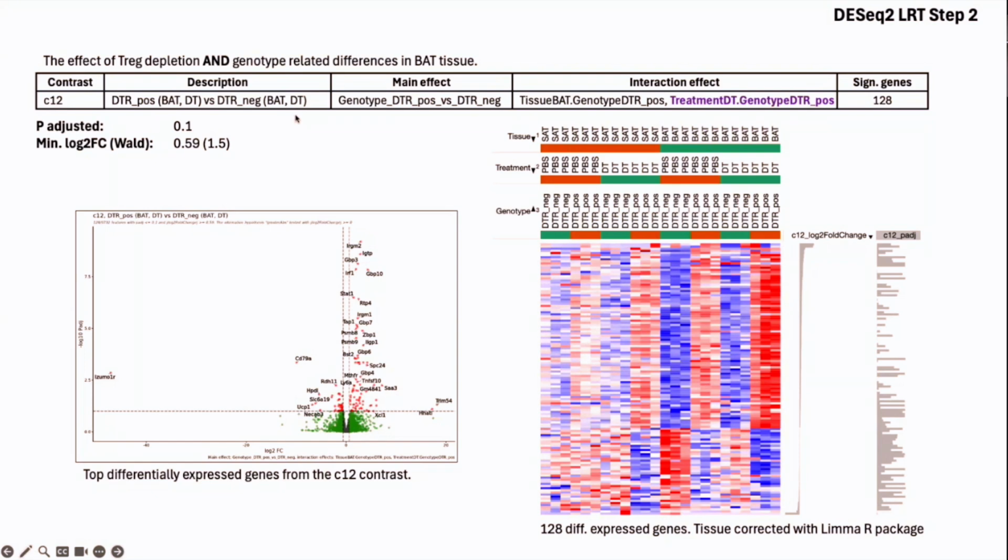And it will give us a heat map, the values for log-fold change and p-adjusted for this particular contrast. And if we sort by log-fold change, we see that we were interested in this contrast between these samples, and indeed we see the pattern of the change between these two groups of samples. And at the same time, we see how these genes are changing in all of the other samples.